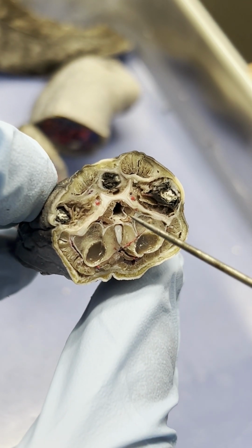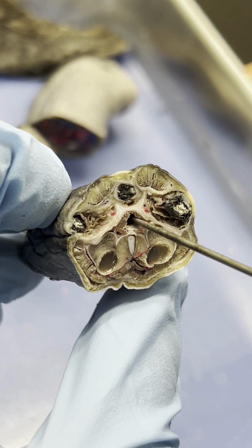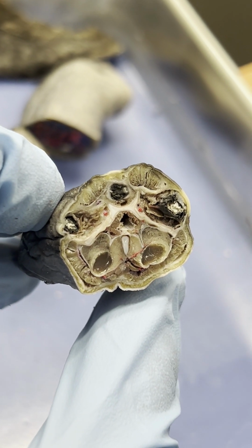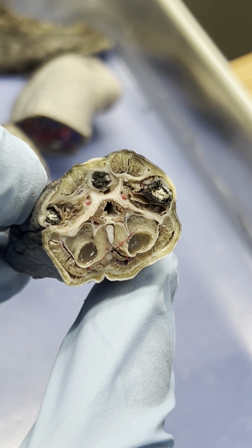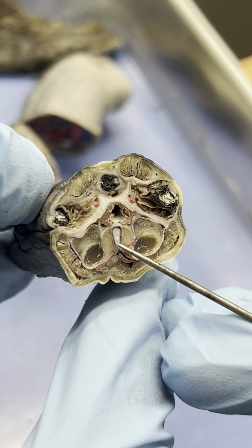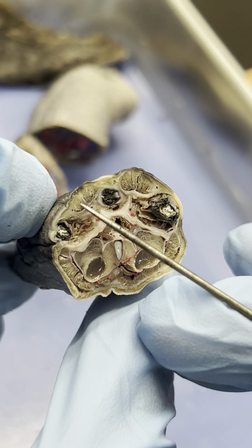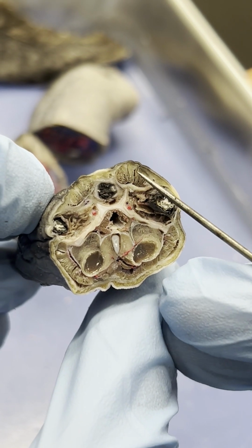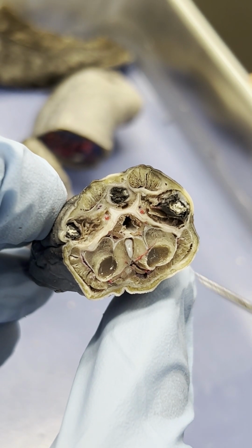We have the buccal cavity, which is this large opening right here. Hopefully you know where the buccal cavity actually goes out to. And then we also have the piston cartilage, which is right here. And last but not least, again, we have our myomeres, which are the different muscles. Dorsal myomeres and ventral myomeres. All right?